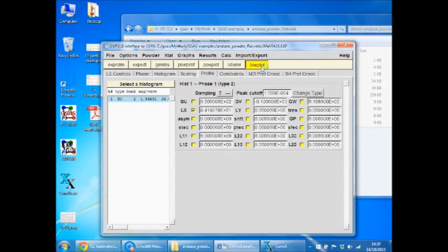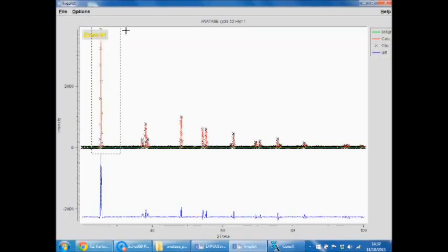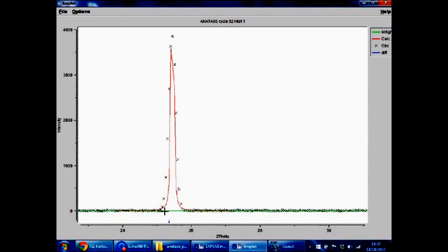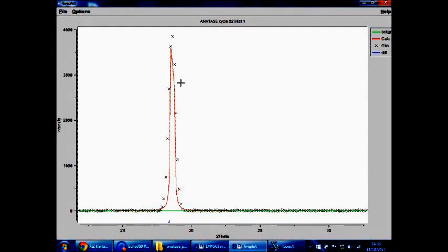But as we can see, it's not really changing much now. And it's not quite reaching the width that is predicted. I think perhaps there's a problem with the way it's trying to model these points too much down here rather than the points up here.